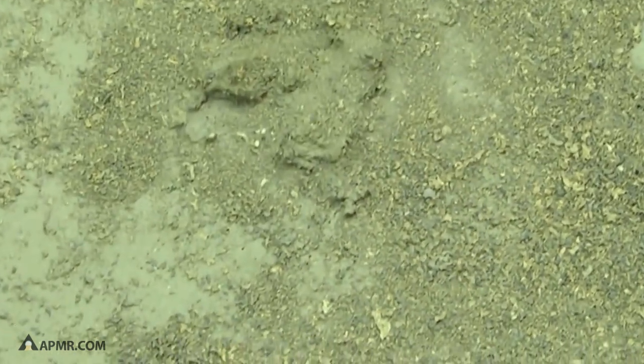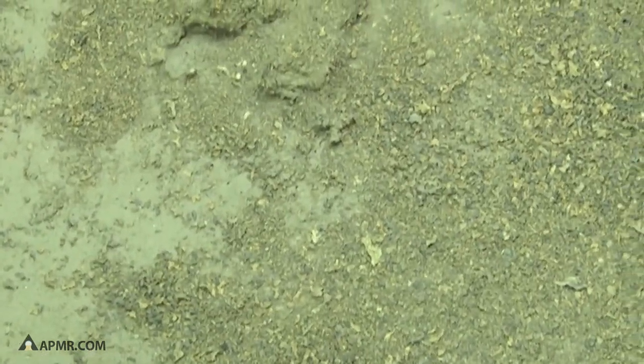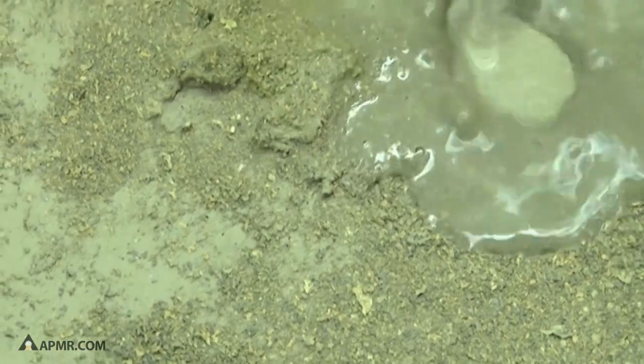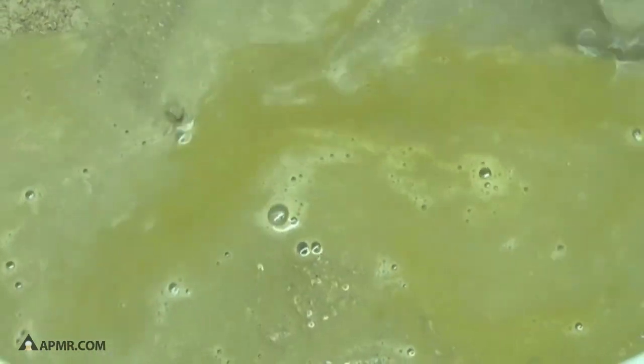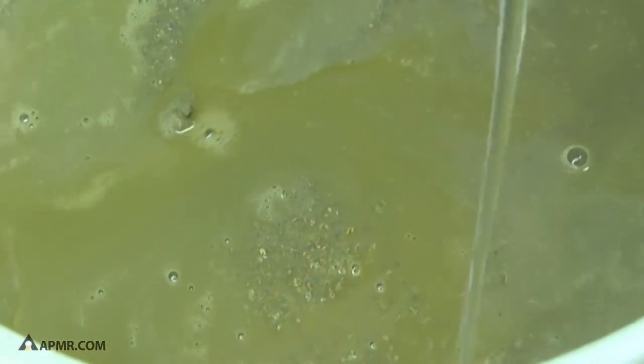Now we're going to rinse our particulate a little bit to make sure that we've got all the gold-laden acid rinsed out of that particulate.